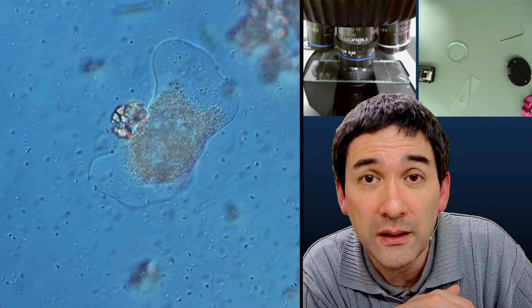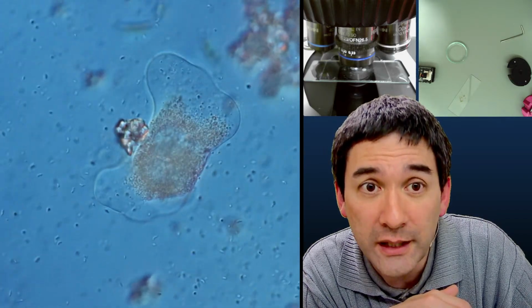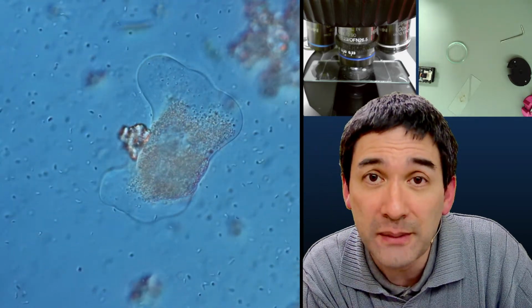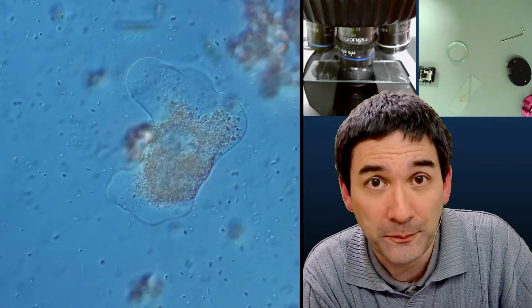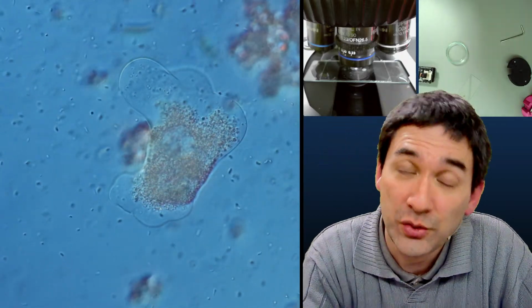This means that for the cheaper microscopes, you have a company in China that manufactures microscopes for all different brands. This explains why the microscopes, or some of their parts, look very similar between different brands, because sometimes they are actually using the same parts.